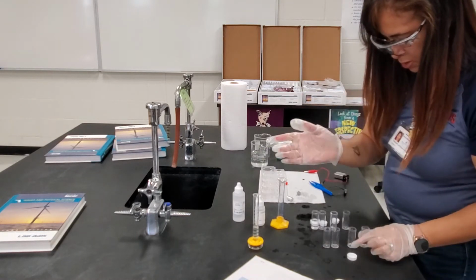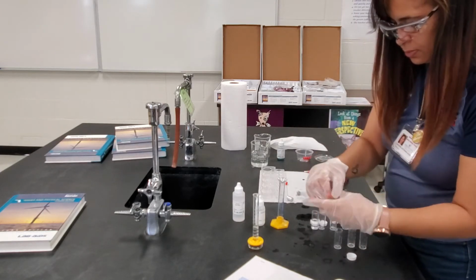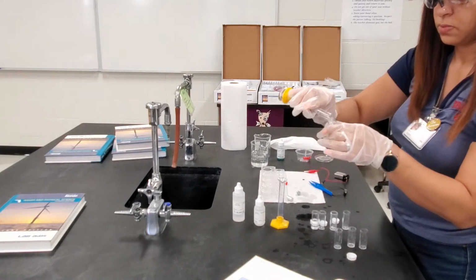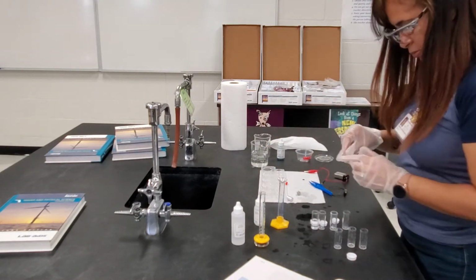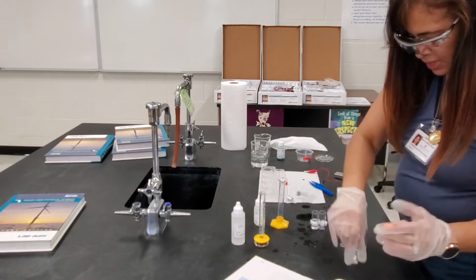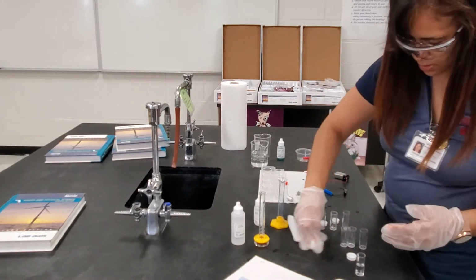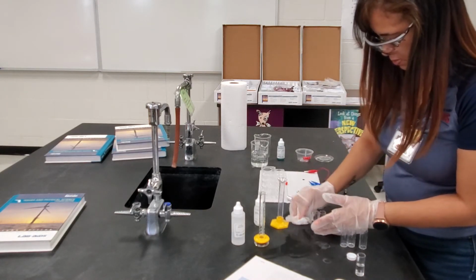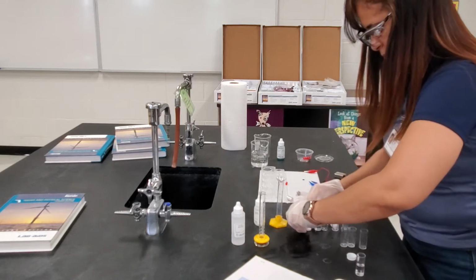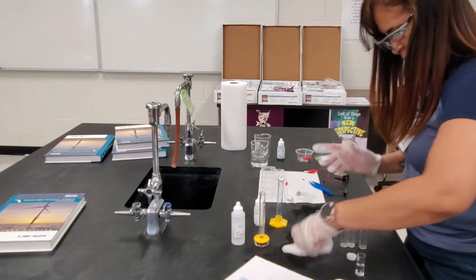And of course, pour it into a fresh vial. Now, since I did get the table a little bit wet, the wise thing to do is to clean it off. Okay.